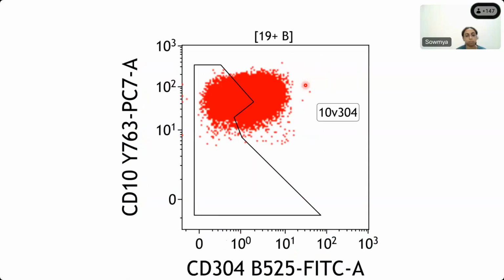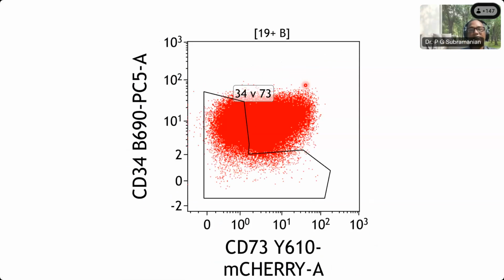So here we are not having everything CD34 positive; CD34 is heterogeneous. You are having CD34 and CD73. Normally this is the way CD34 and CD73 are. So CD73 also becomes a leukemia associated phenotype because it is not falling in the normal region. If any normal cell is CD34 positive, it should not show CD73. In this, CD34 is positive, but it is showing CD73. So that is the way we describe abnormality based on the phenotype. So this is abnormal.